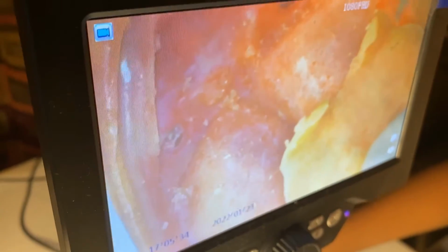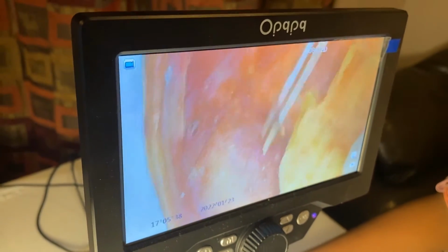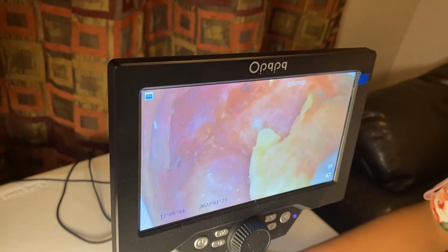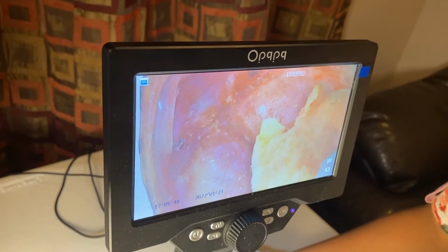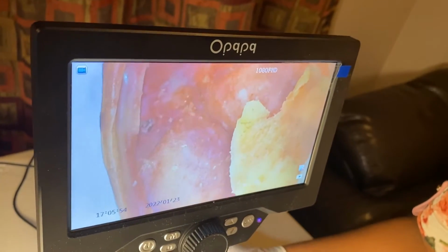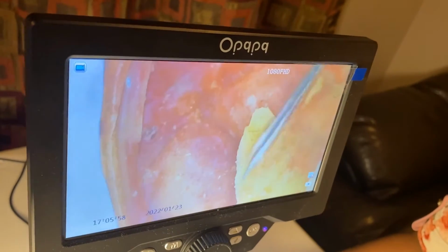Like I mentioned earlier, the eyes of the frog are really big. So big that they even create indents on the inside of the mouth. Now the really cool thing about this is when the frog grabs its prey and pushes it inside the mouth, the eyeballs push downwards to help the frog push the insect down the esophagus.